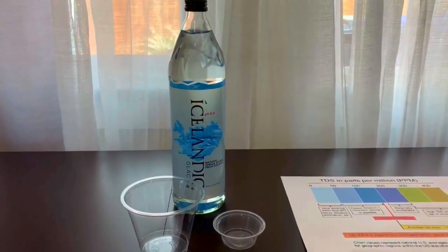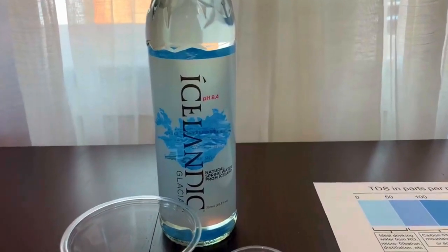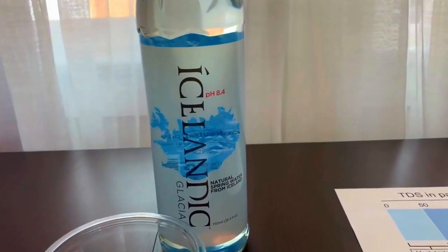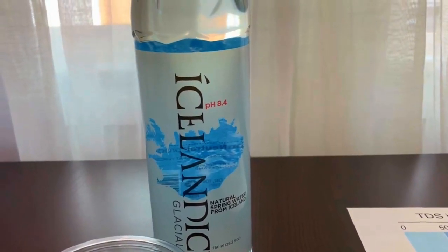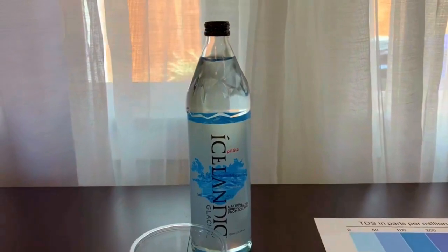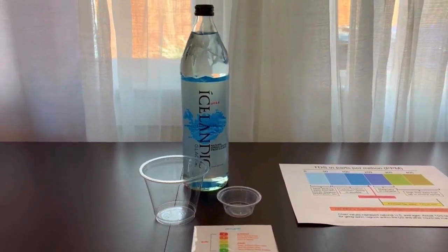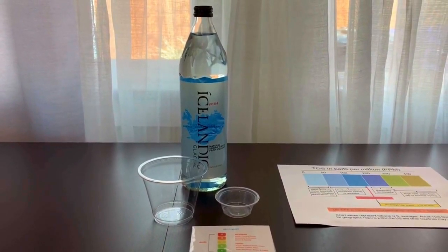This is Iceland Glacial Natural Spring Water, bottled at the source of Ulfis Spring, Iceland. It comes with a naturally occurring pH of 8.4 at the source. This bottle is made from glass. We already tested Icelandic water with a plastic bottle, and now we will test this glass bottle to see if there is a difference.